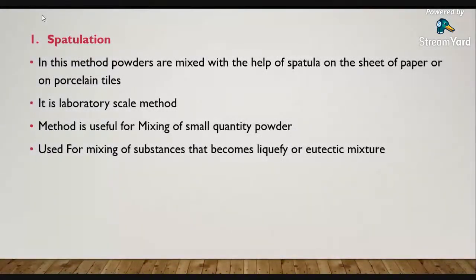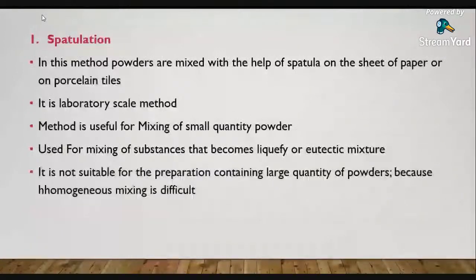Or the powder contents which liquefy after absorbing moisture are known as deliquescent or hygroscopic substances. For those materials we can use the spatulation method. I have already said that this method is used only for small size preparation of powder and not for large size preparation, because in large size manufacturing there will be difficulty in homogeneous mixing of ingredients.